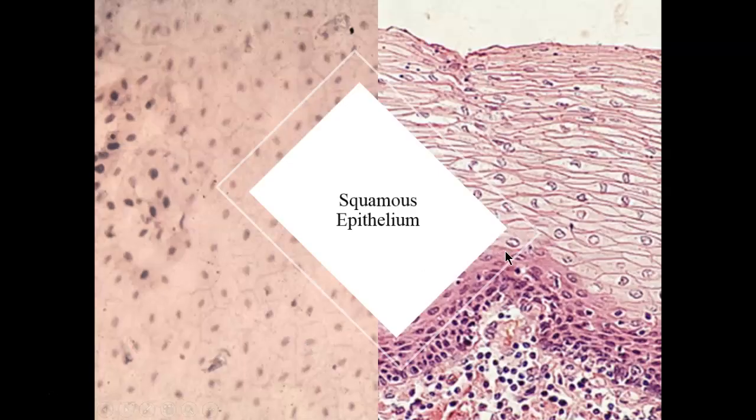All right, so remember we talked about squamous epithelial tissue, and I showed you this very image, but just a little bit differently. I wanted you to be able to relate these images to what you've seen already. So if you look down on the surface of squamous epithelial cells, remember you're going to see sort of flat, irregular shaped cells.